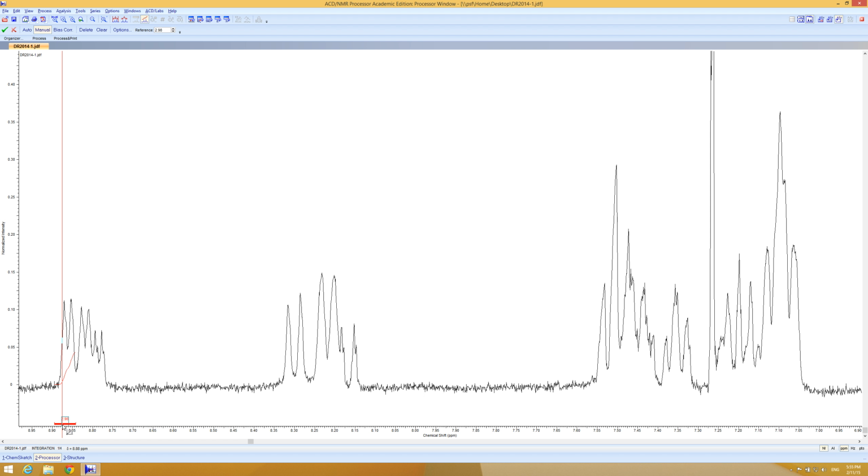And it sort of gave me a number of 2.98. I want to set that to 1, so you get a reference. You reference that as 1. Alright, that's 1. And we go and draw over this peak, just this section right here, that should also be 1. And 1.02, very close. We go down here, we do this integral, draw over that, 1. Good. Over here, draw this. It should be 2, which it is, 2.